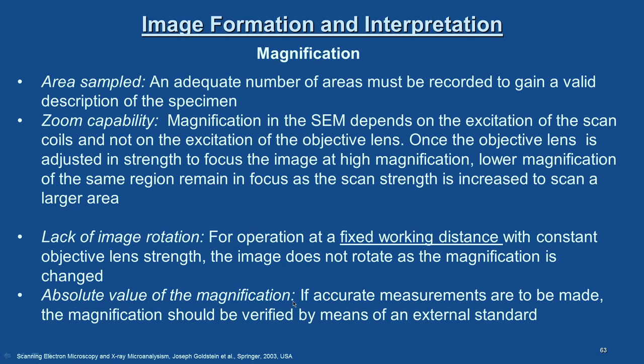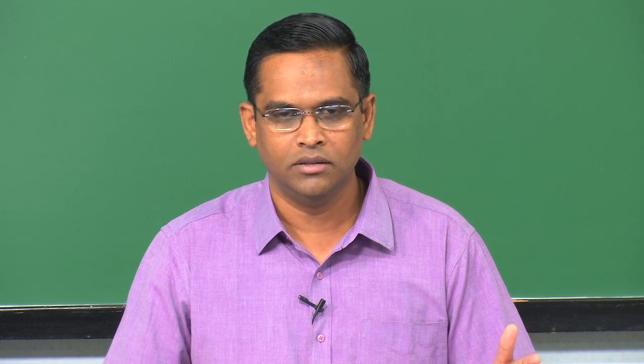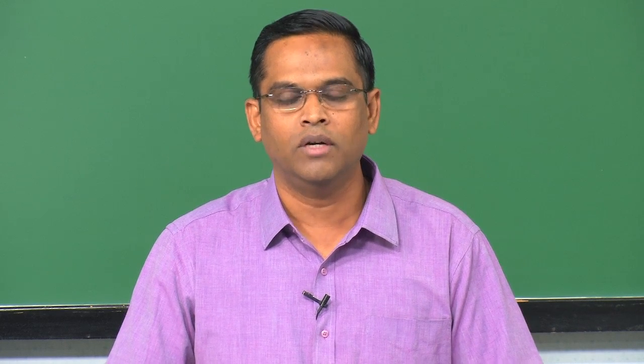Absolute value of the magnification, of course, if somebody is interested in this aspect, if accurate measurements are to be made, the magnification should be verified by means of an external standard. So, for example, if you want to do very sensitive measurements, very accurate measurements, then let us use some kind of a standard, a scale or something, or a grating, under which you calibrate the distance as you do it with a different magnification.